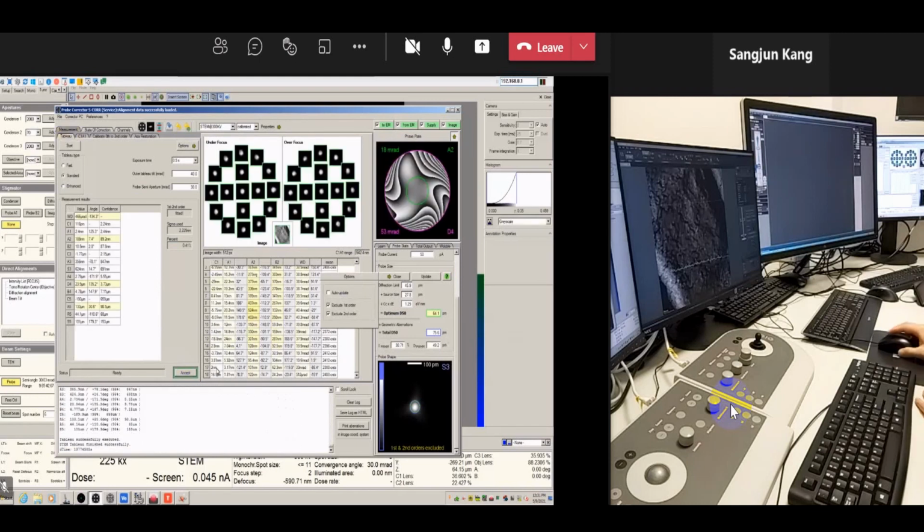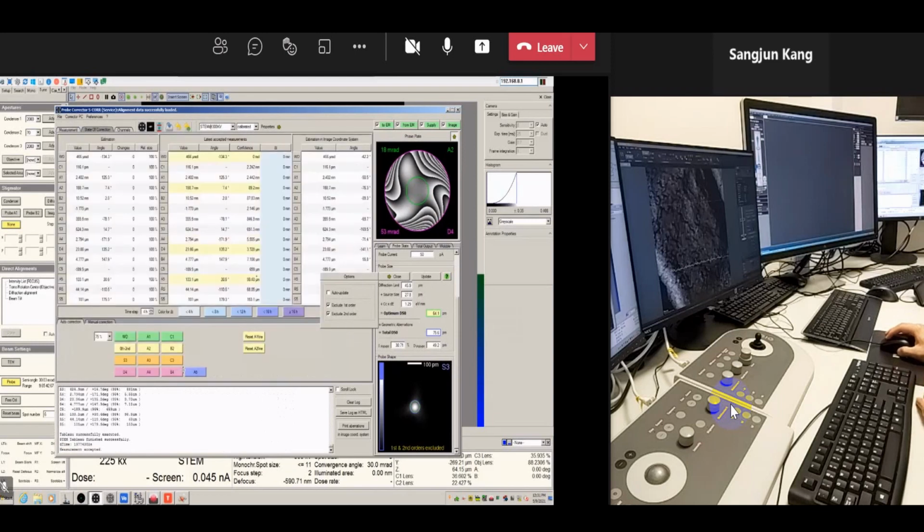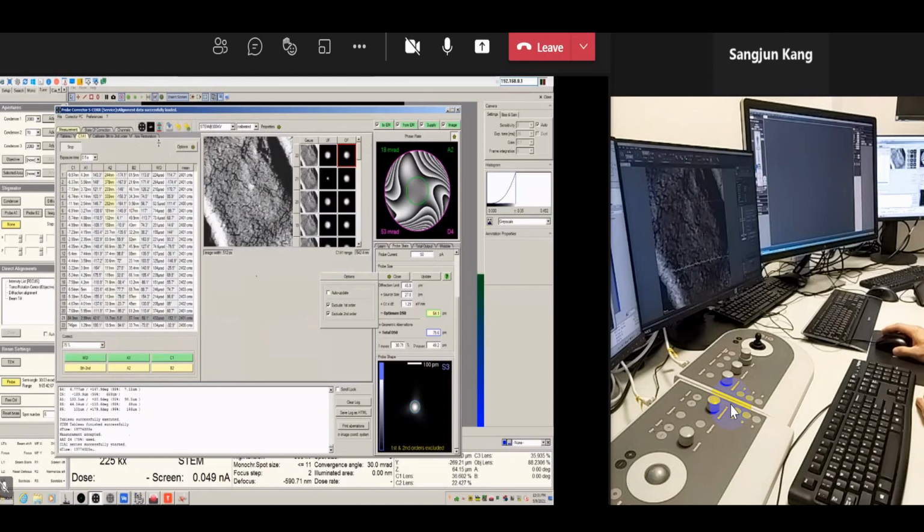So now A2 has a problem in D4. Maybe just for today, we tune up to D4, because my video is ending too fast. So I'm going to tune D4, up to D4. Here I will tune D4 by 75%, and I go to the low order aberration correction.